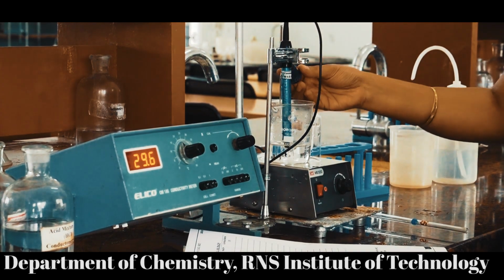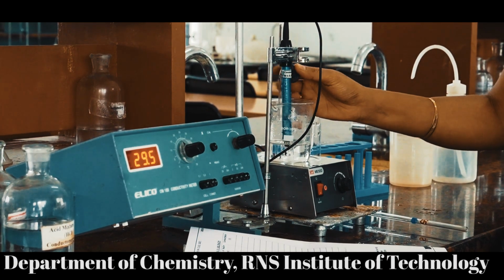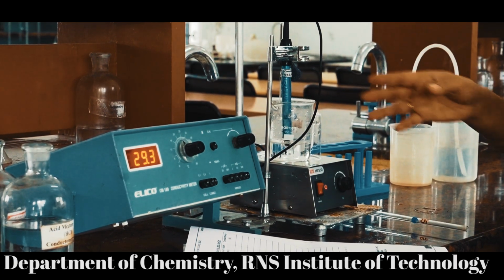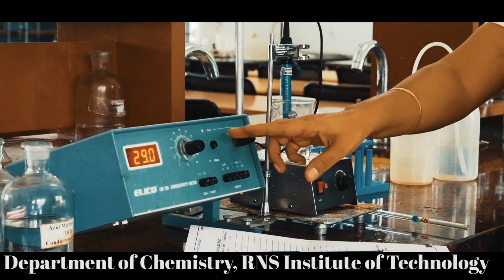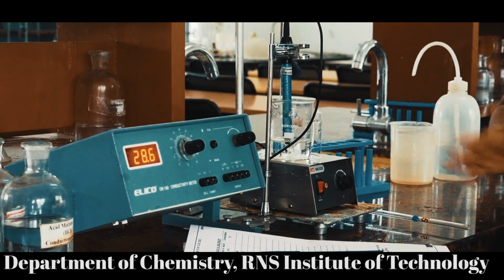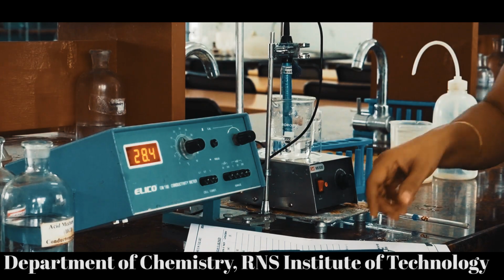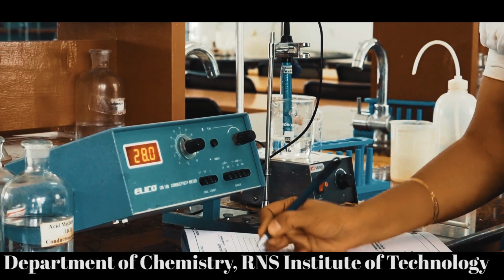Then again add 0.5 ml. Then we should wait at least 2 to 3 seconds because it will take some time, or until you get a constant reading, then note down the reading. This decrease in the conductance continues till the neutralization of HCl. So 28.1.